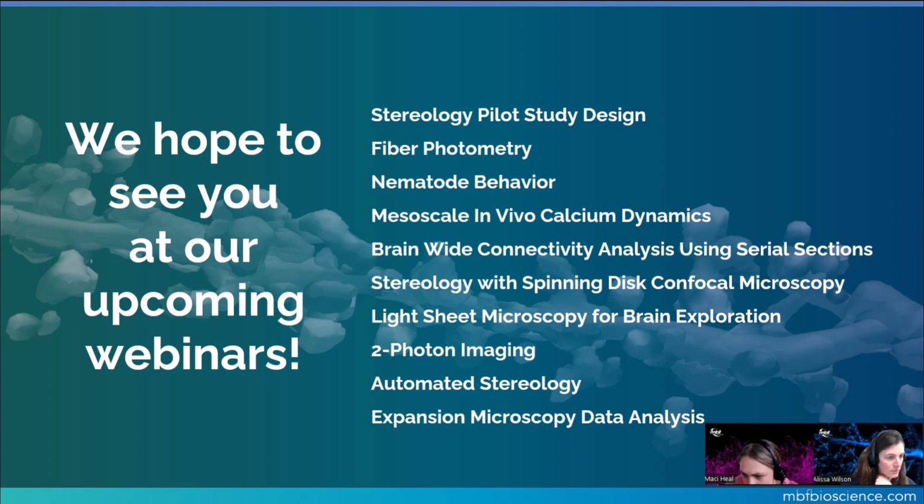And then does the analysis give a distribution of the diameters of different vascular segments and their lengths? We also report the diameters of the segments themselves, so the average diameter of between two nodes, but also specifically at each point along the vessel, and the length of those segments too. So specific segments, whole networks, and down to the points.